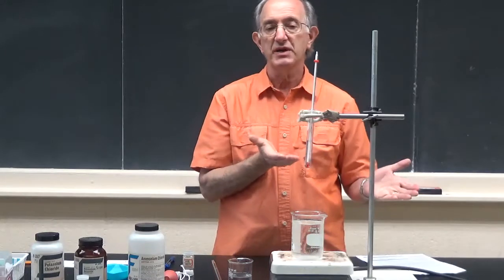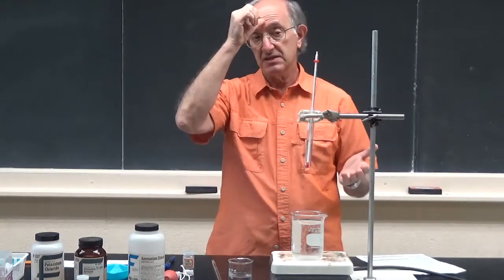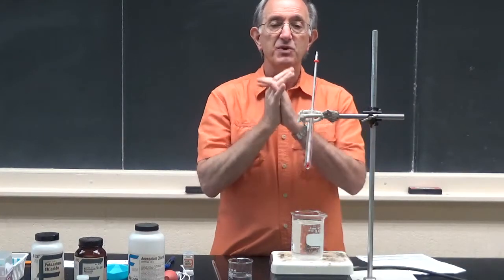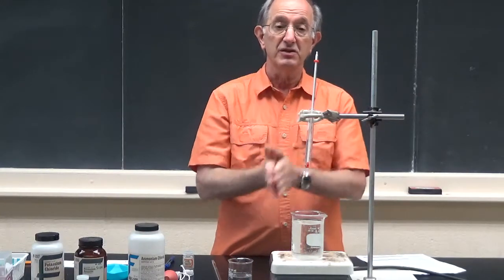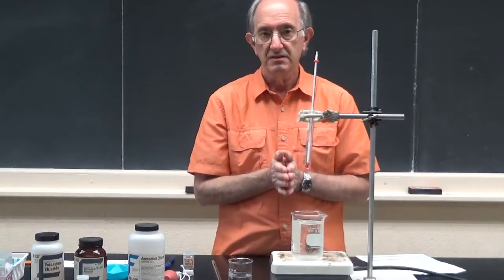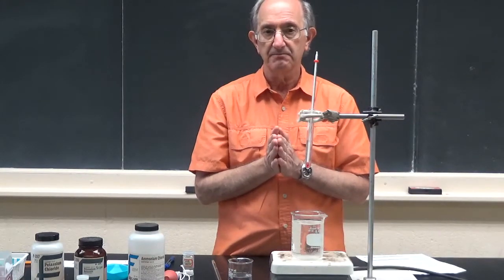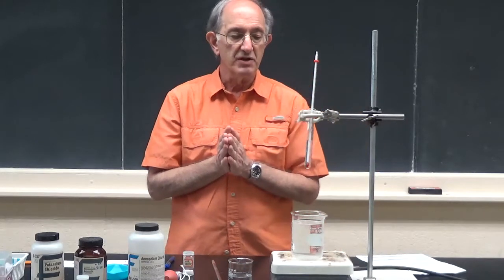Why do we do it this way? It's really difficult to see when all of a solid has dissolved. It's much easier to see the appearance of solid after it has been dissolved.